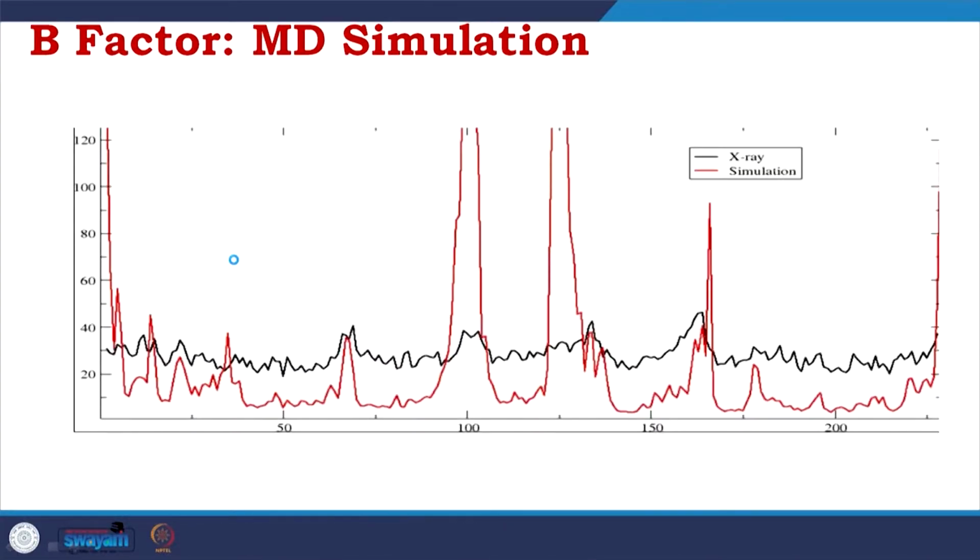More interestingly, simulation. As I talked about, in simulation we have a force field, and we develop force field parameters depending on what types of factors influence the biological macromolecule. For example, for protein we take bonded parameters, which are bond stretching, angle bending and torsion.